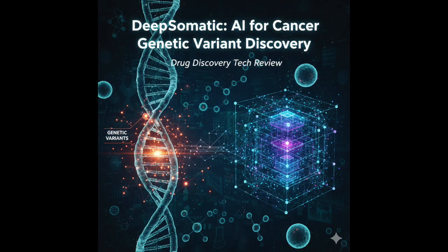That's clever. But it's not just a simple black and white image of A's, T's, C's, and G's, is it? You mentioned multiple channels, like a detailed map. Right. It's much richer than that. This is where the deep learning power comes in. The tensor has multiple channels, each encoding different kinds of information about the reads at that position. The source paper mentions 5 main categories feeding into these channels. What kind of information are we talking about?